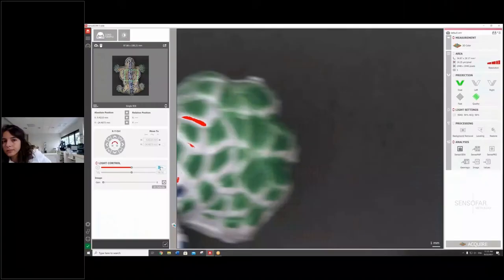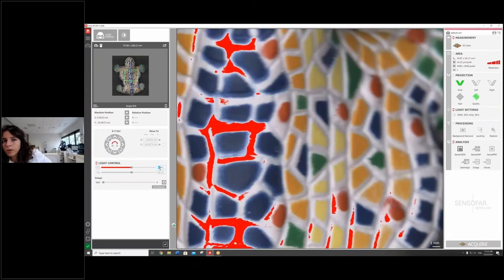First of all, I'm going to use this sample here, which is a souvenir from a tiny piece of art from Gaudí, a really famous architect from Barcelona. So without further ado, we're going to just place the sample.